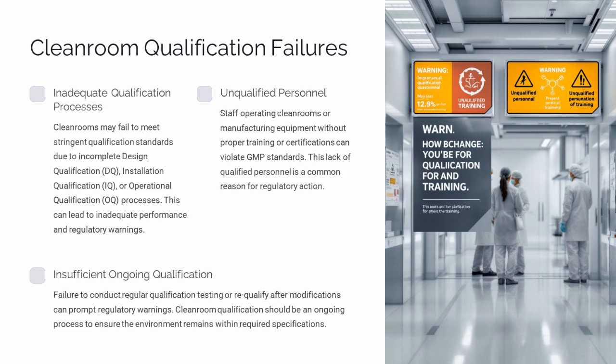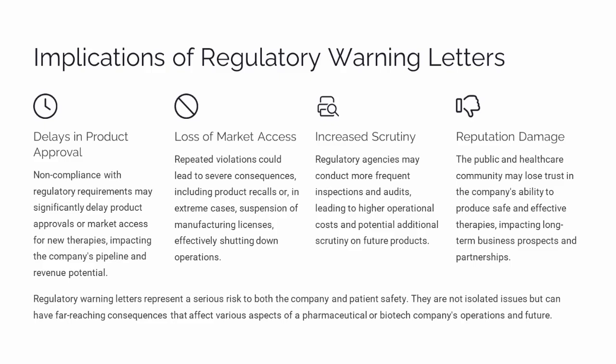Failure to conduct regular qualification testing or re-qualify after modifications can prompt regulatory warnings. Cleanroom qualification should be an ongoing process to ensure the environment remains within required standards. Non-compliance with regulatory requirements may significantly delay product approval, impacting the company's pipeline and future projects.